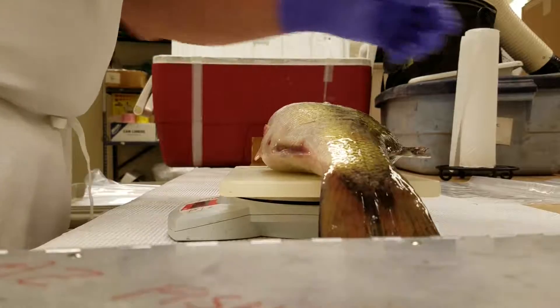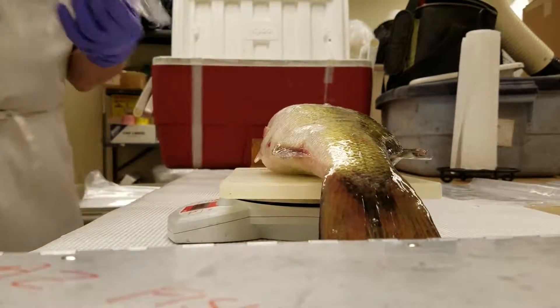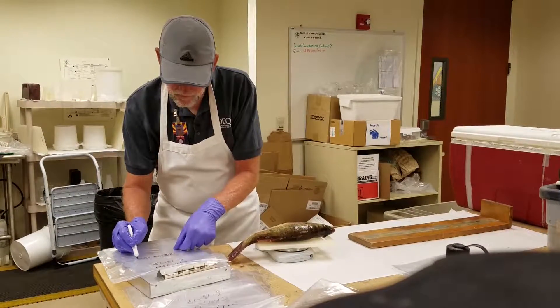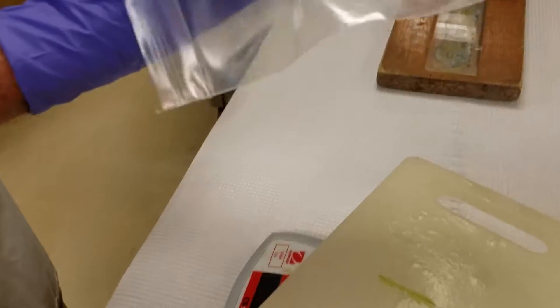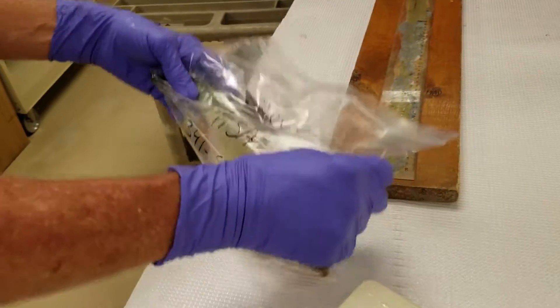We weigh and measure them here and we compare them to all of the other fish in the state of that species, and we get their condition factor. Once we have the fish all weighed and measured, they get bagged up.